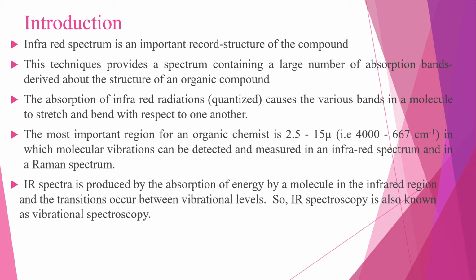So, the IR spectrum is produced by the absorption of energy by a molecule in the infrared region, and the transition occurs between vibrational levels. So, IR spectroscopy is also known as vibrational spectroscopy.